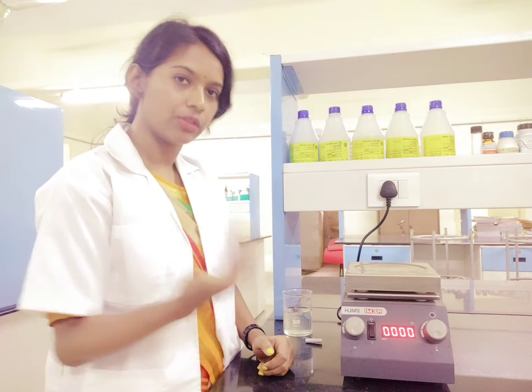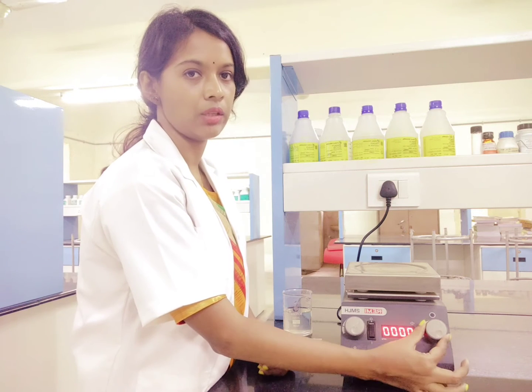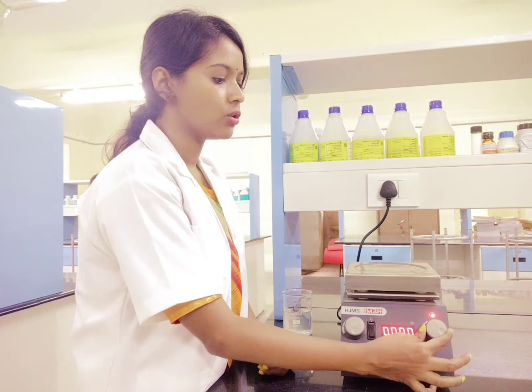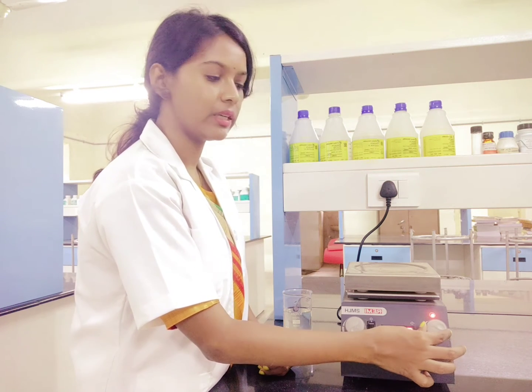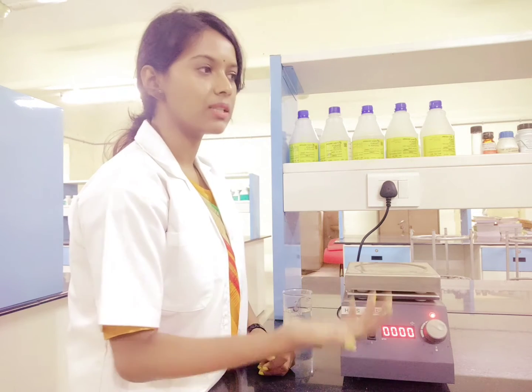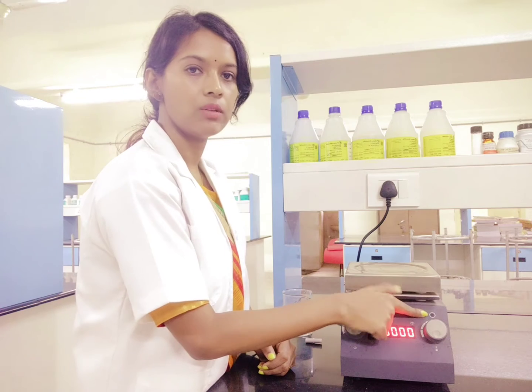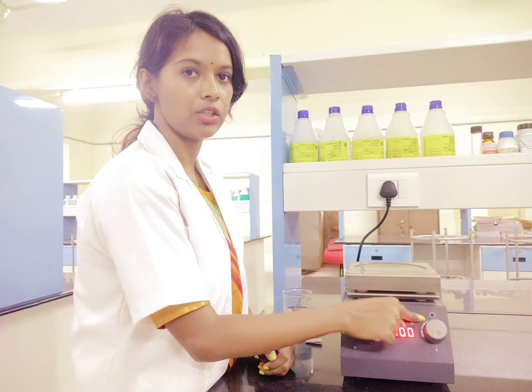Whatever temperature treatment you want to give, you can set that temperature using this regulator — the temperature of the thermocontroller. Once it comes to red, that means the heating is on. If you do not want the heating, if you just want the mixing only at room temperature, then you can just turn it off, and you will see there is no red light indicator.